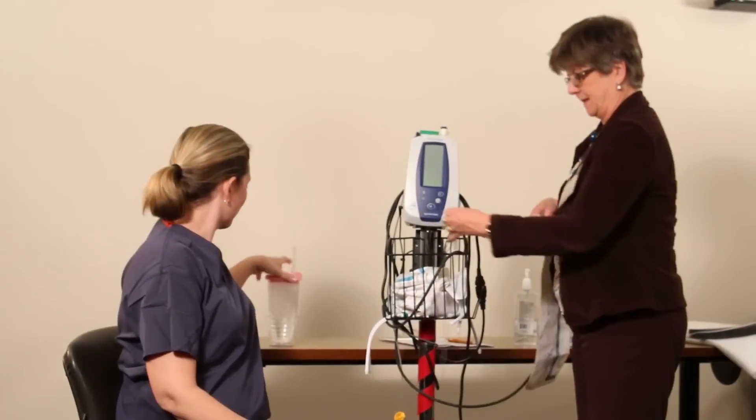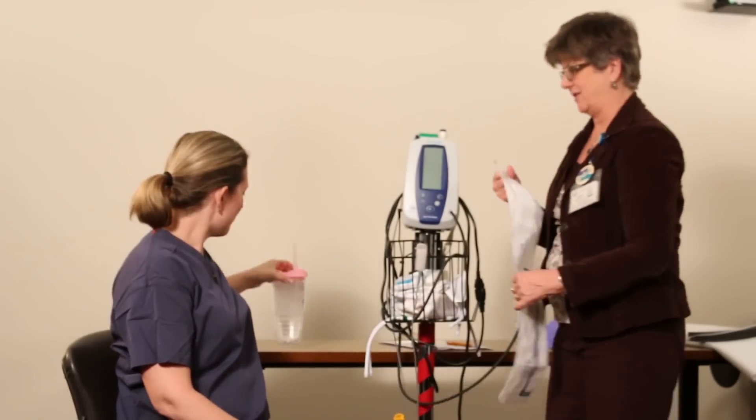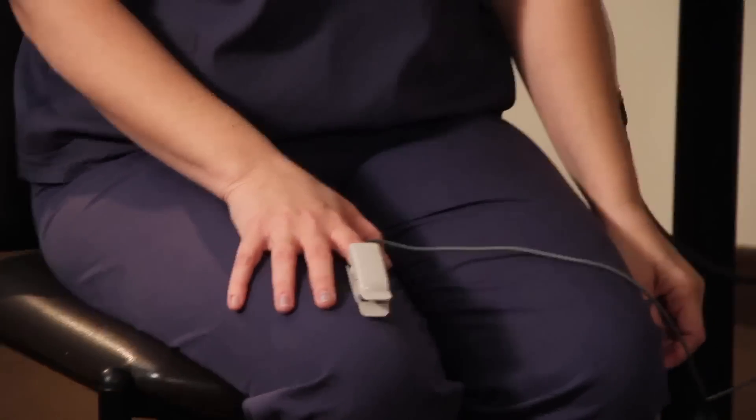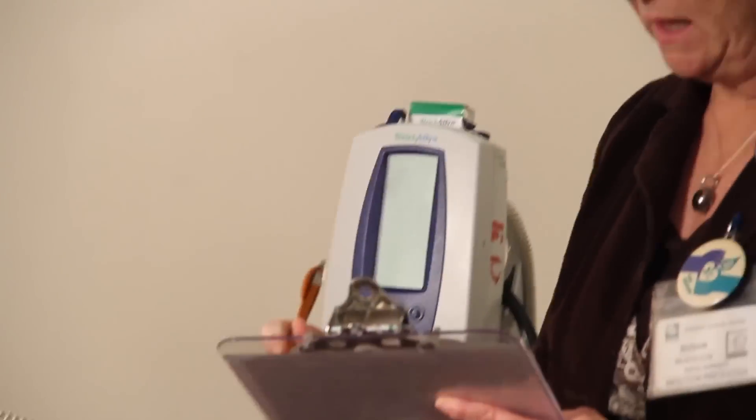Before you begin donning your PPE, you will want to drink eight ounces of water so that you are hydrated, and also use the restroom. Your safety officer will check your vital signs to ensure you are healthy and able to put on the equipment.